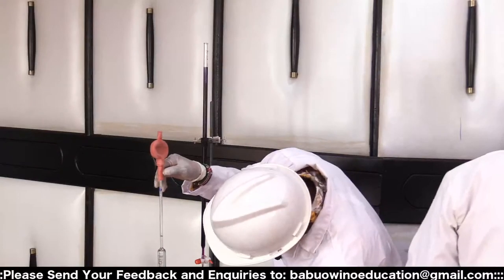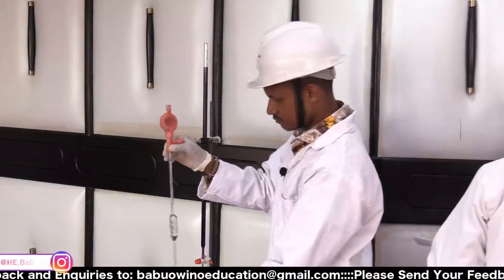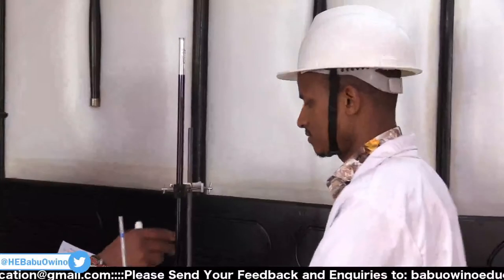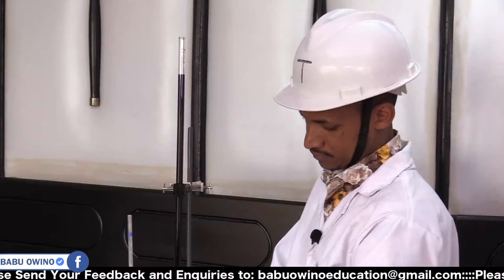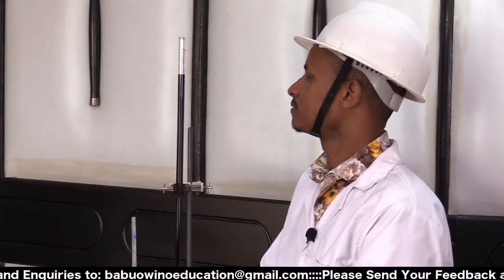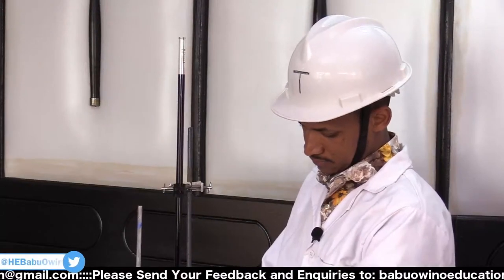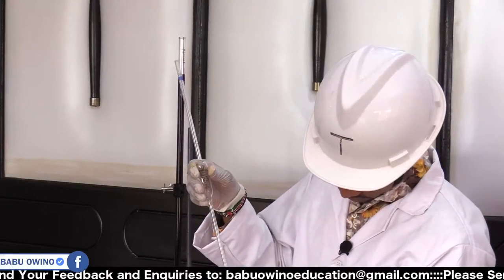This is the first titer, the second, and maybe the third, if our solutions allow. We can label them like that. Initial reading: the reading is 1.2. Remember, if you're working together, to confirm. This is the final reading in centimeters cubed, this is the initial reading in centimeters cubed, and this is the volume of the permanganate used.